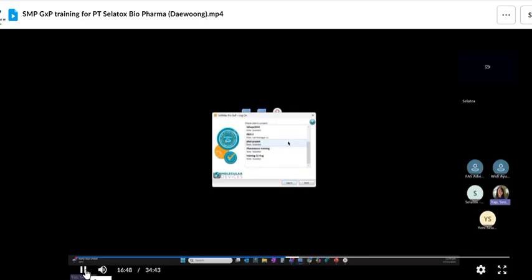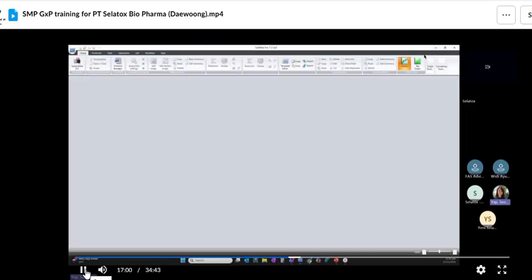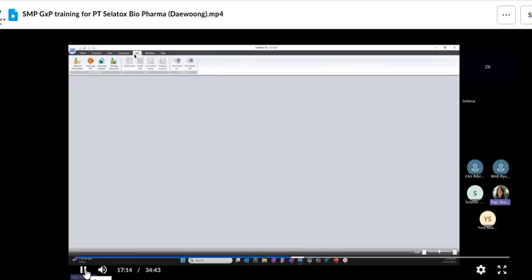So next, you can see what project I'm in. You see some of the projects where I'm a lab manager role. When you log in, it's normal to see some of the options not available. It could be you do not have the permission. So if you want to check, you come here, GxP here.